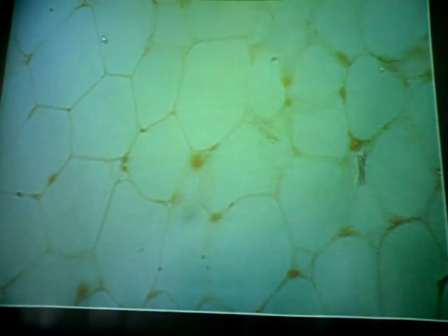External to the adventitia, we have more connective tissue, and this one is what? Adipose. That is adipose. For some reason, A&P students, when they come out of A&P 1, have often forgotten the tissues, but there's one tissue they remember, adipose. Which is fortunate because you've got adipose almost everywhere. You know, around organs, below the skin, and so on.